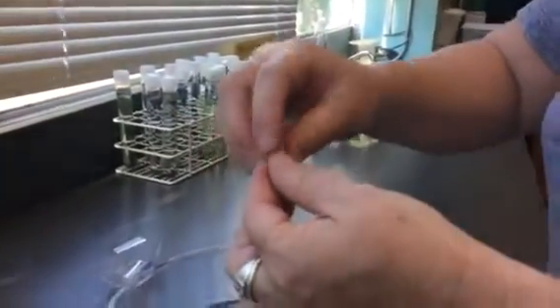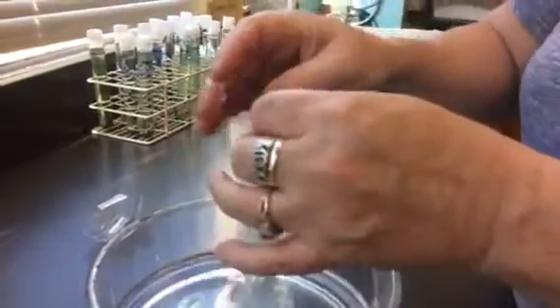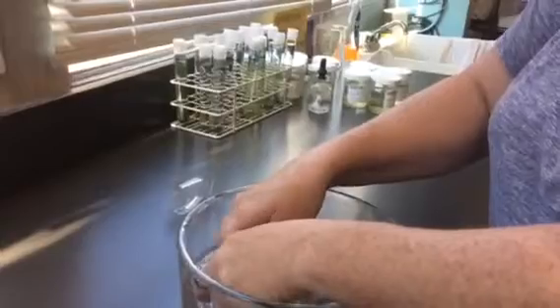And so what we want to do is tie a knot in one end, okay? You want to be careful because your fingernails will cut the plastic. And then you're going to pour your solution. See, notice here, we're going to open it up. You're going to pour your solution into the other end. I'm just going to fill this up with water right now so that you can get a feel for what it's going to look like.